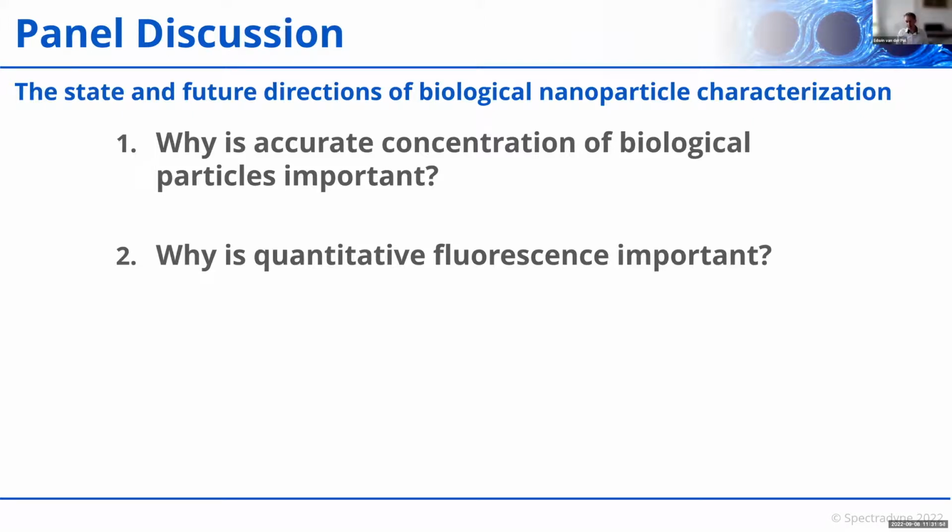Yeah, I think preferably, actually, I think most people in the field are not interested in how quantitative you can determine the fluorescence itself, but they are interested in the end in how many receptors did I bind with my label, right? Or even better, how many receptors or particular proteins does my particle have?